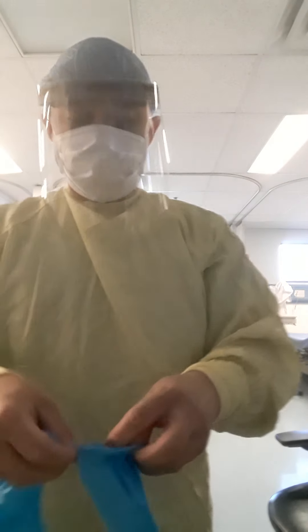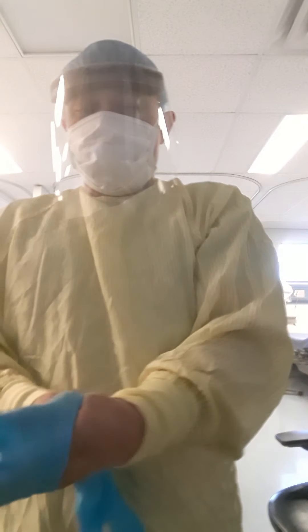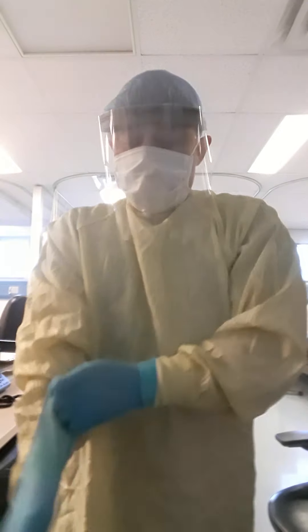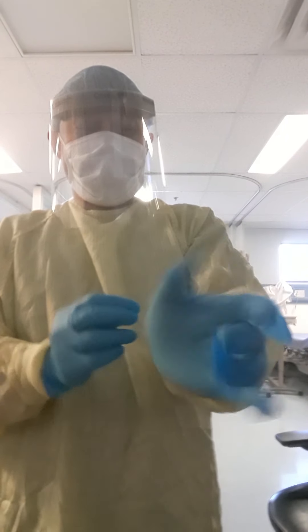And the last one is the gloves, guys. Okay, so there you go — the proper way to put on PPE for contact and droplet precaution.